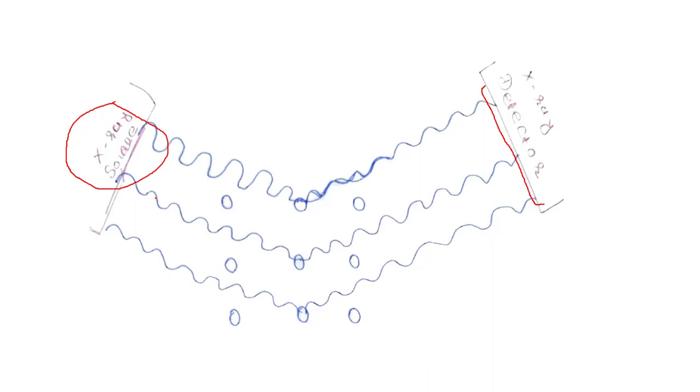Likewise, we have lots of atomic structures in the material placed on the sample table, and X-rays are emitted from the X-ray source and impact the atoms, and from that they are diffracted by the atoms and received in the X-ray detector.